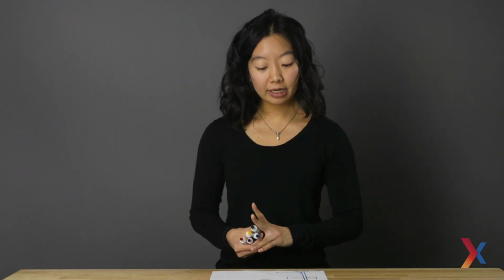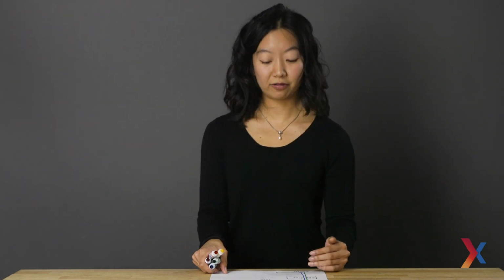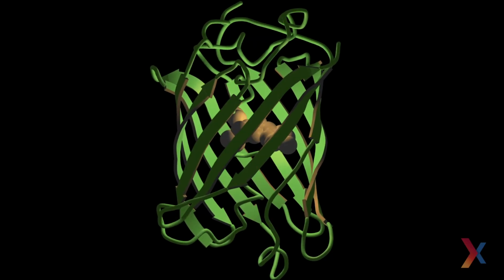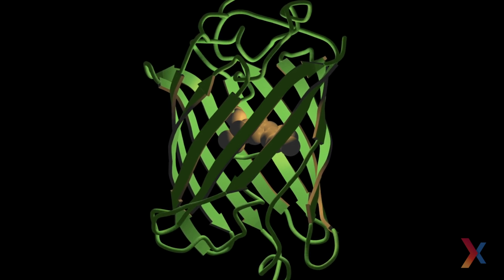The key takeaway here is that we're not actually visualizing the fluorophore or the fluorescent protein itself on the sample. We're detecting the signal that is emitted by that fluorophore or fluorescent protein. In this way, we're able to find the location of things that are incredibly small and too small to see by using light as a proxy for where they are. So we can detect down to single molecules even though we can't actually see the molecules themselves.